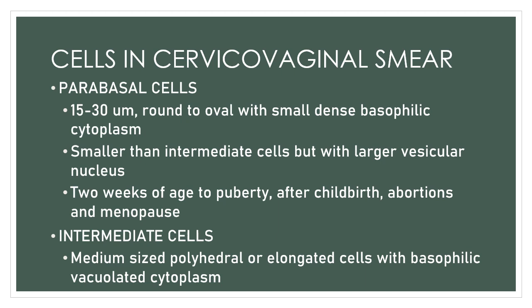These are seen from 2 weeks of age to puberty, after childbirth, abortions, and menopause. They may be present in proportions which may determine the stage of the sexual period of the patient at the time of ovulation.